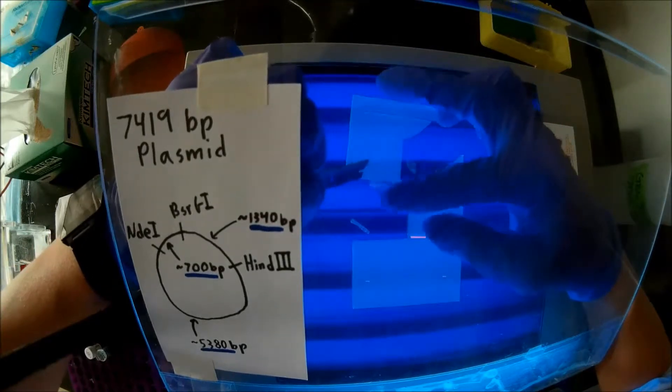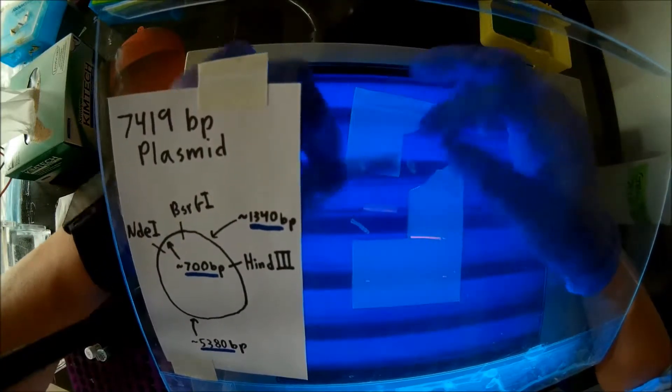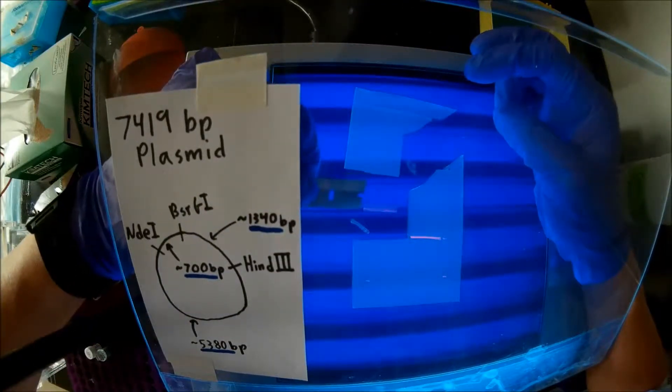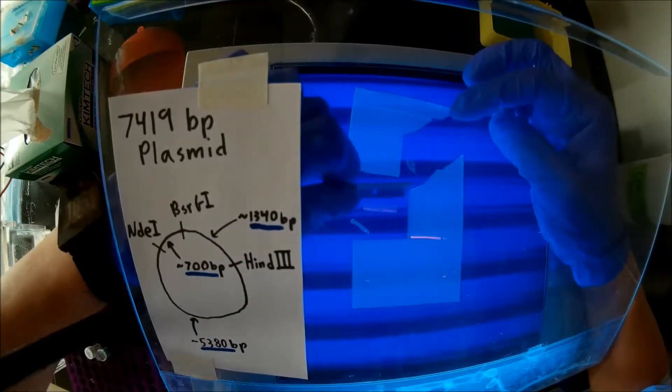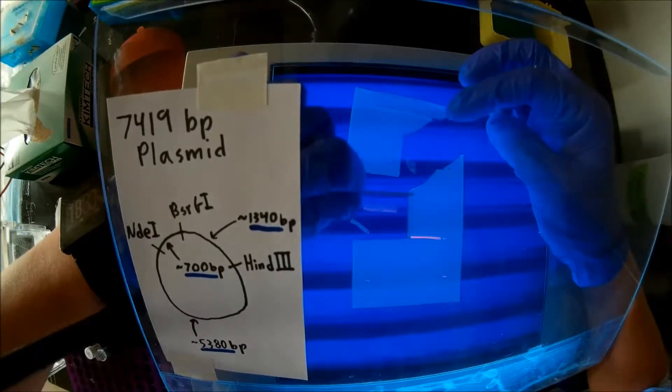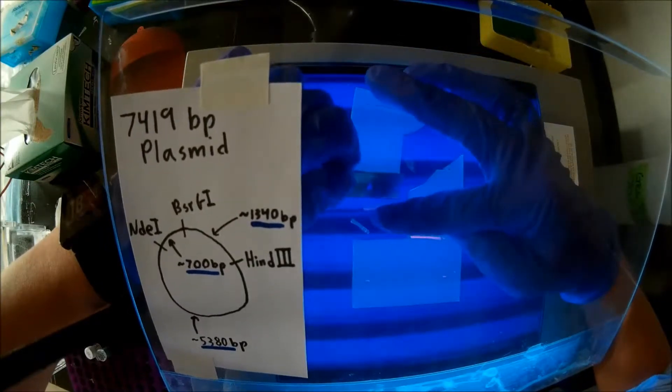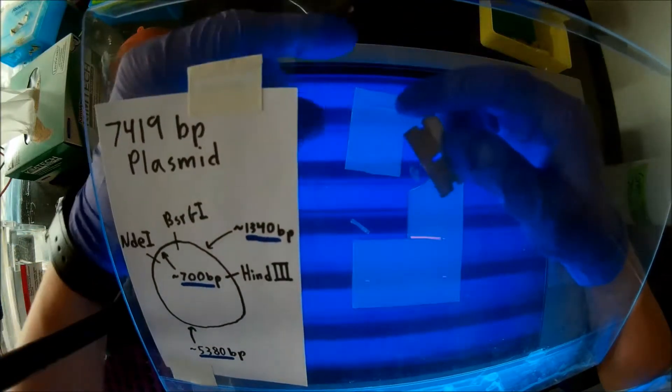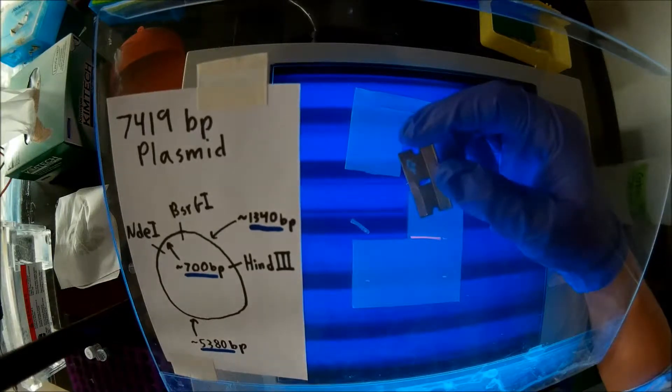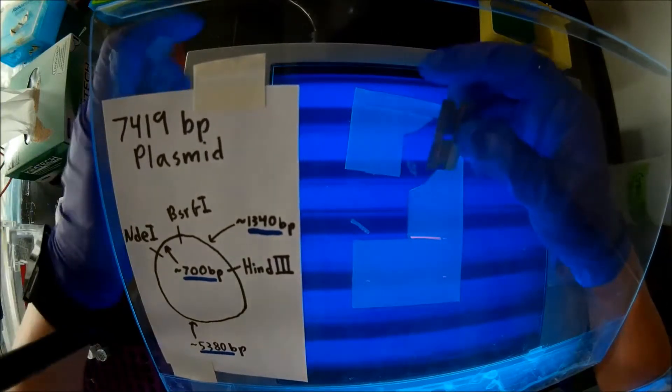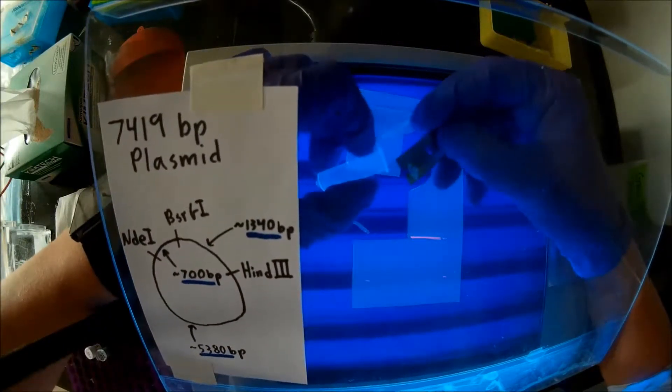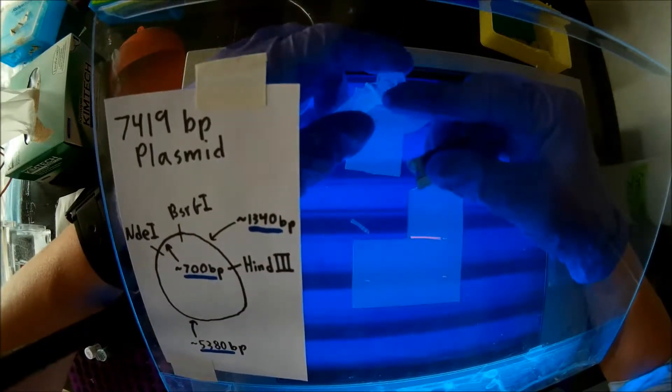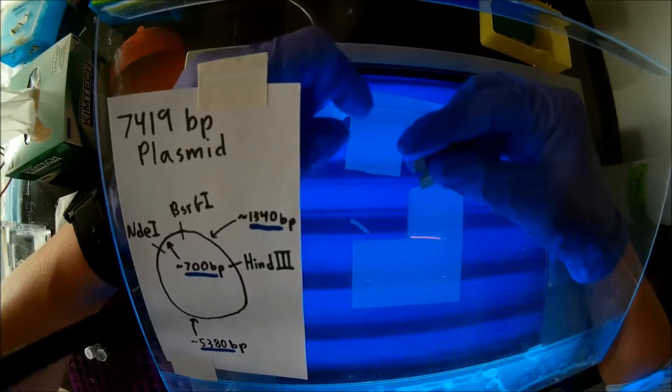So, as you can see, it looks like my DNA goes basically all the way up to the top of the gel. It fluoresces orange all the way up. If, for example, you poured a thicker gel, you would want to cut off any part that wasn't fluorescing. So, now I'm just going to push that up onto the... You'll want to make sure that your gloves are clean also before you do this. I'll push that up onto the razor blade. And then I'll just kind of scoot that gel fragment down into the 2mm tube.